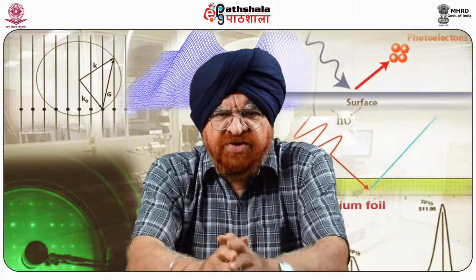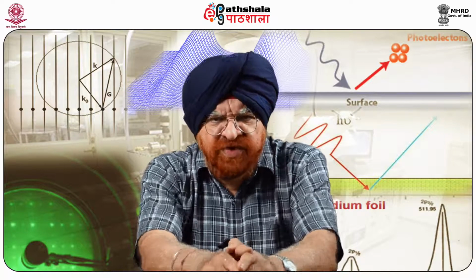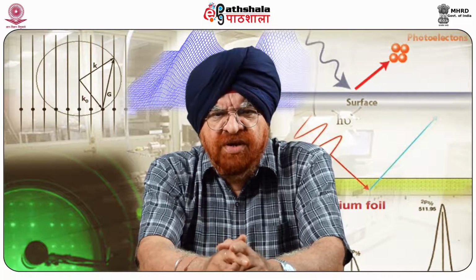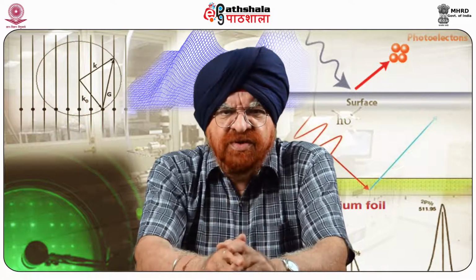The normal deflection is used to measure changes in surface topography, while the lateral deflection provides simultaneous information regarding changes in the friction or surface energy.